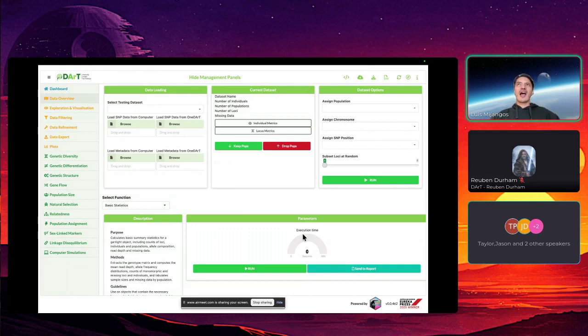And it has been a lot of work for all the team. And now we have an interactive version of dartR, including all the 200 functions of dartR and counting. And hopefully with all the help of the users that are attending this workshop today, and during this week, we are going to increase the number of functions many more times.